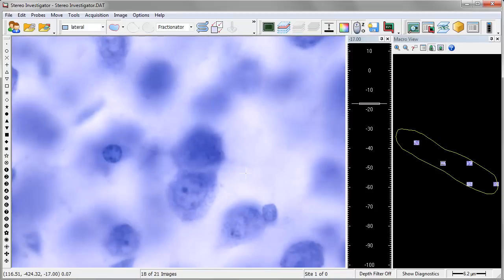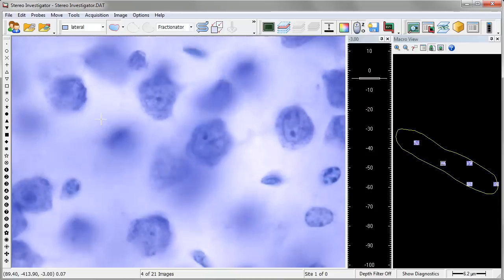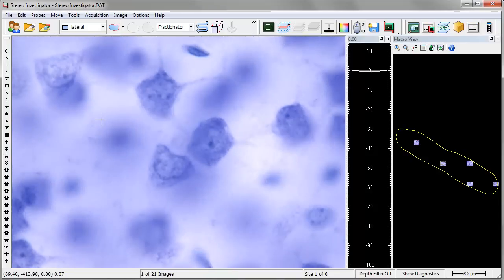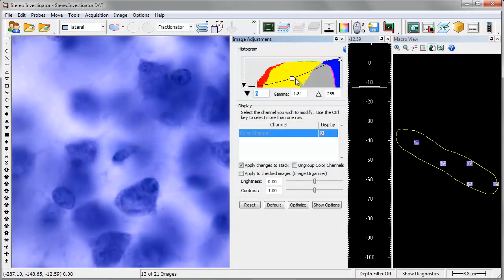With StereoInvestigator, you are able to obtain the most efficient, precise, and unbiased estimate of cell populations and morphometric properties in biological structures.